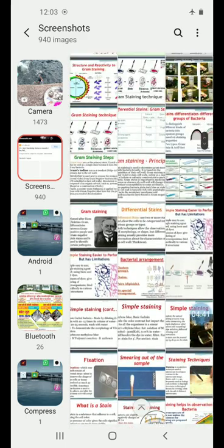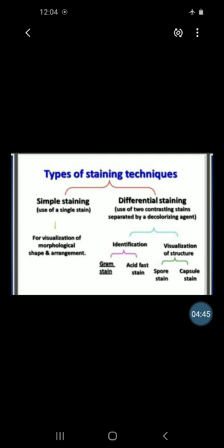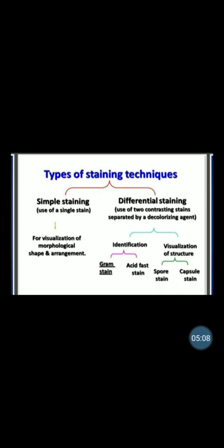Then we will see the types of staining technique. In that, first simple staining and second differential staining. In simple staining, in this technique there is use of only one, a single stain, and in differential staining there is use of two contrasting stains separated by a decolorizing agent.